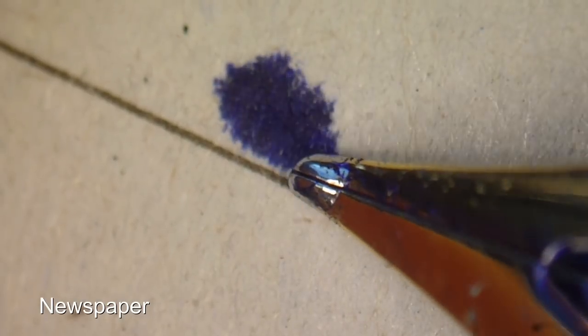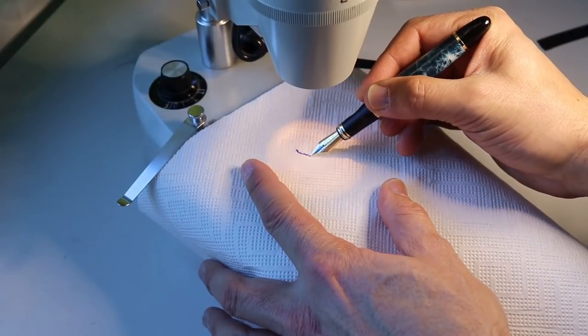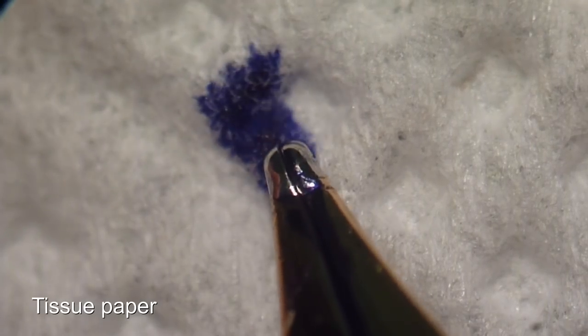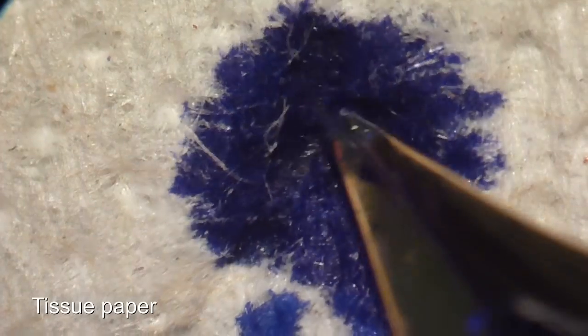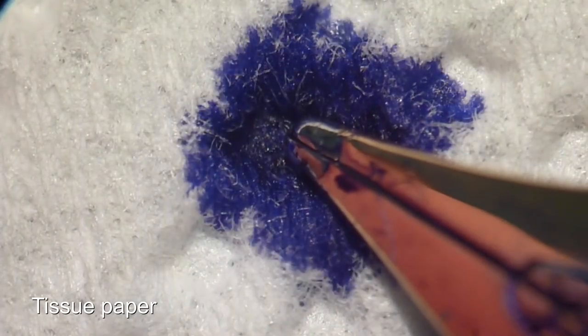And now this is newspaper, and you can see that the ink is absorbed much more. It flows apart a little bit, and you can see that the individual fibers are also a little bit more visible, and the ink flows along these fibers. This is now at 40 times magnification. And I'm also using some tissue paper. You can see the texture of the tissue paper, and it is highly absorbent. Newspaper again. Toilet paper, also very absorbent. And again, tissue paper.